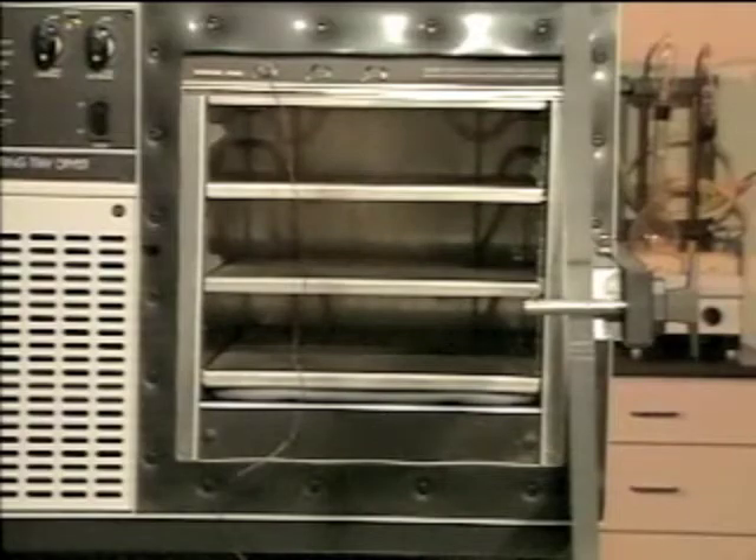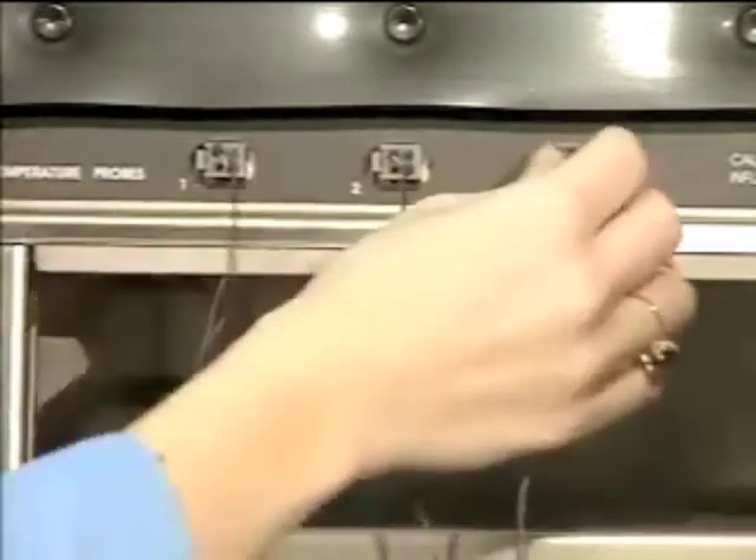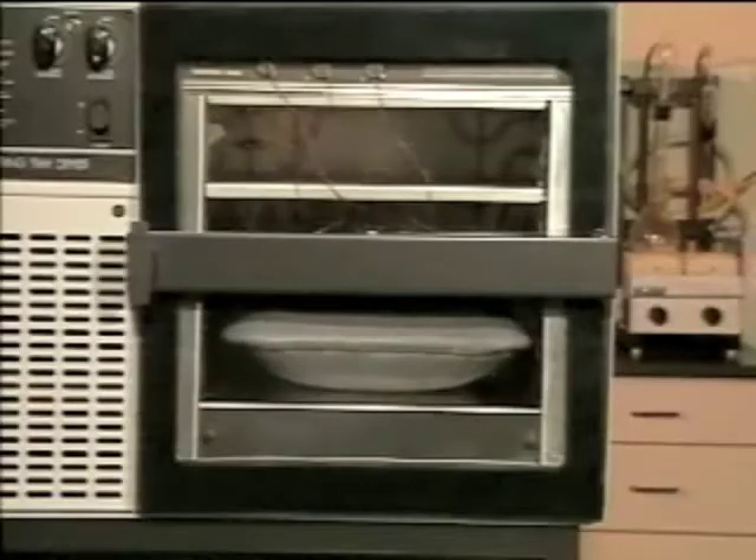The Stopper Ring Tray Dryer has a vacuum chamber with three temperature-controlled shelves to accommodate batch or bulk samples, three temperature ports which connect to three probes to allow constant sample monitoring, and a built-in pneumatic diaphragm for Stopper Ring under vacuum.